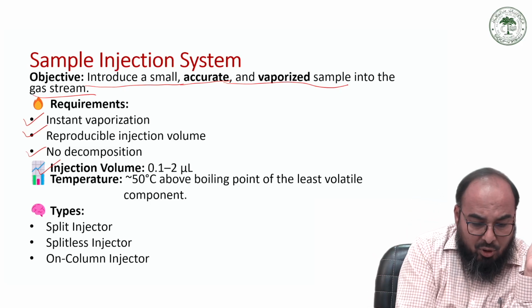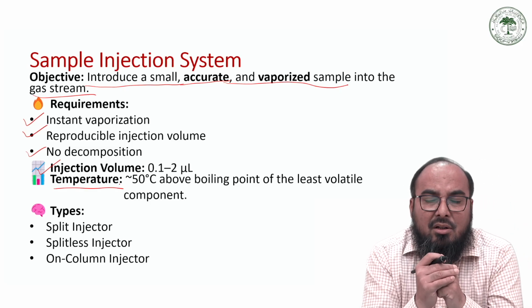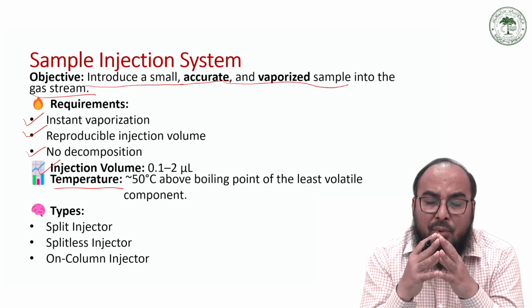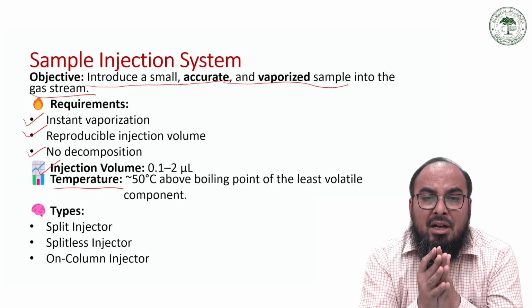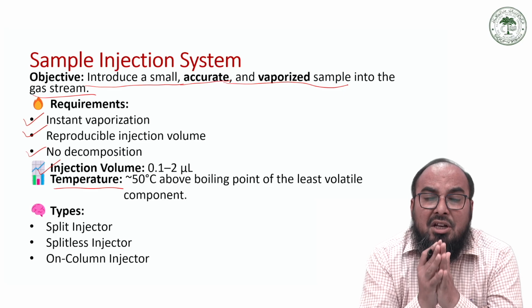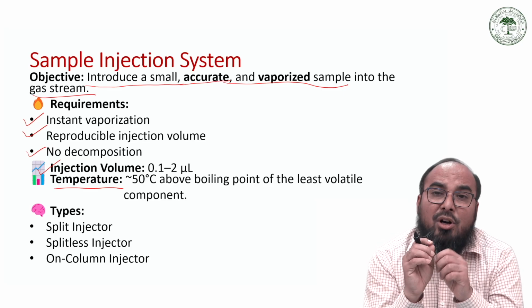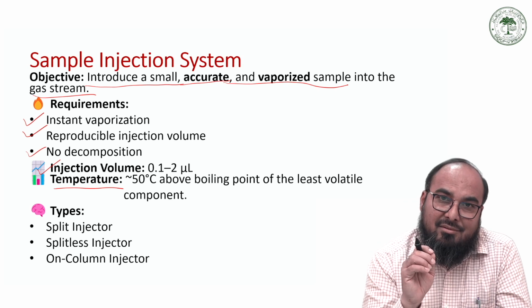And most importantly, this is the most important feature: your sample injection system, your sample injection port, must be maintained at least 50 degrees above the boiling point of the least volatile component.